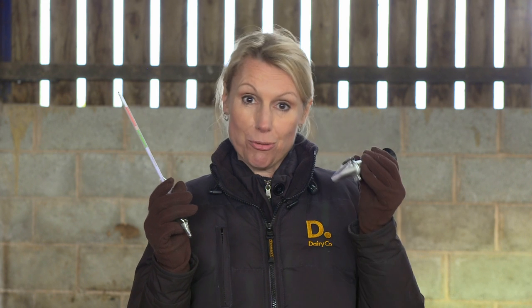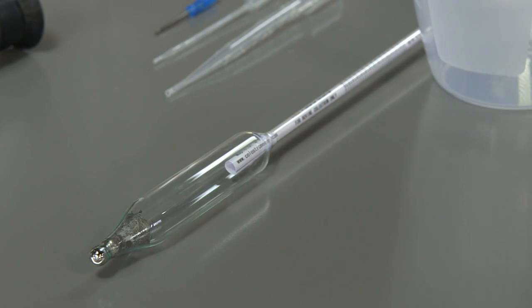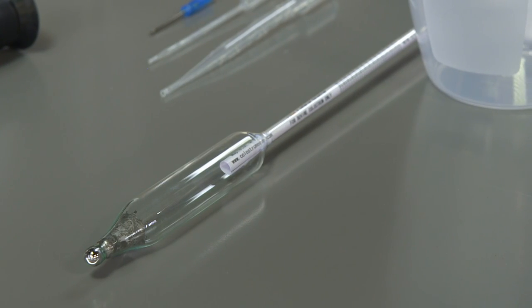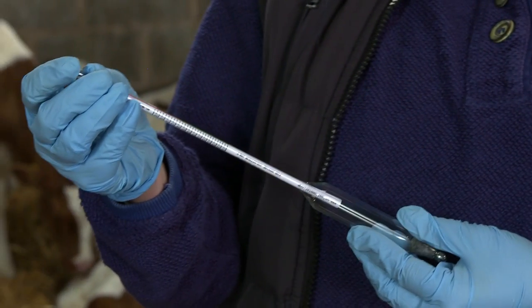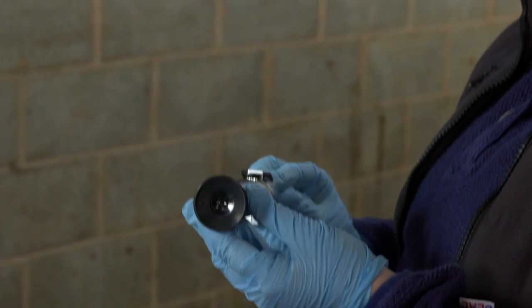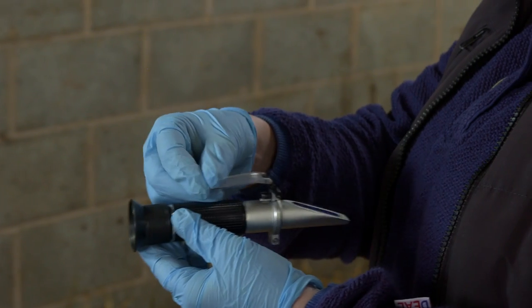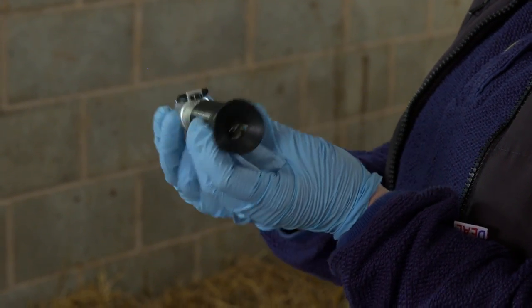There are two instruments you can use to determine the quality: a colostrometer or a brix refractometer. You can use either method, but each one has its own advantages or disadvantages. You can purchase either for a similar price. However, colostrometers may be more easily broken than refractometers and can be affected by the temperature and the frothiness or density of the colostrum. The refractometer is more robust and accurate in its readings of quality. There are many brix refractometers out there, and you need to purchase one ranging from 0 to 32%.